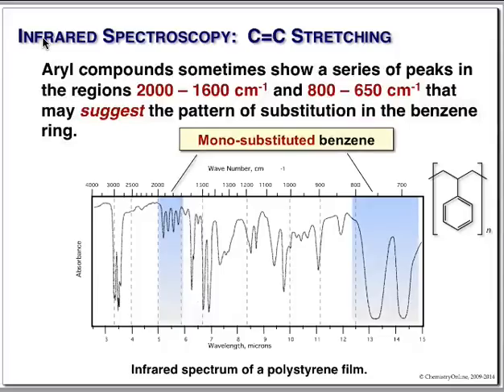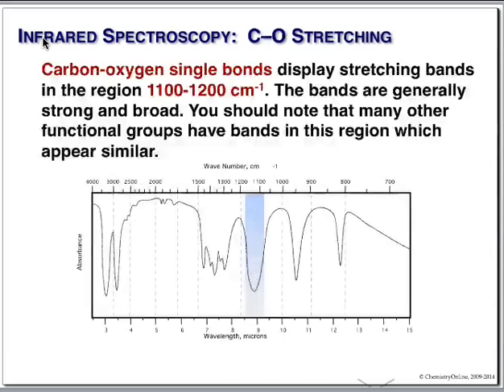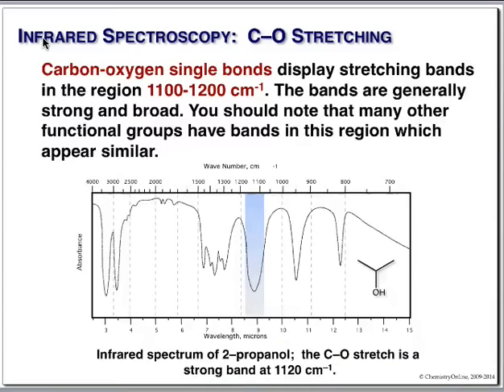Now the last stretch that we're going to look at is CO. Now this occurs down in the fingerprint region. So we're really not going to look at this very much because there's so much that can occur down here. So you look at this backwards. If you have a compound with a CO in it, then you darn well better have a peak in this region. Doesn't work the other way around. If you see a peak in this region, that doesn't tell you it's necessarily a CO. Any questions?